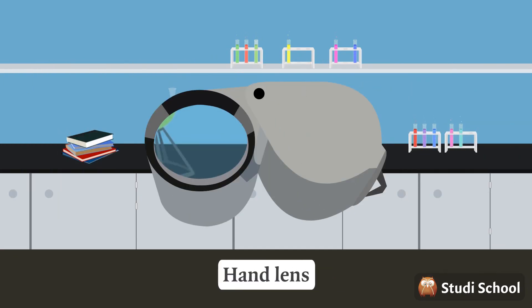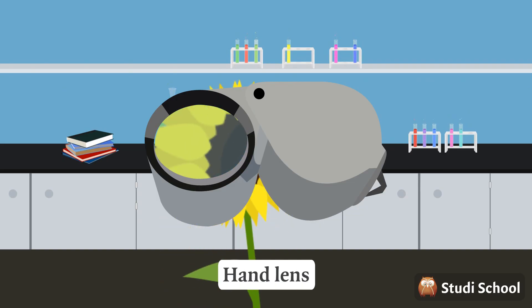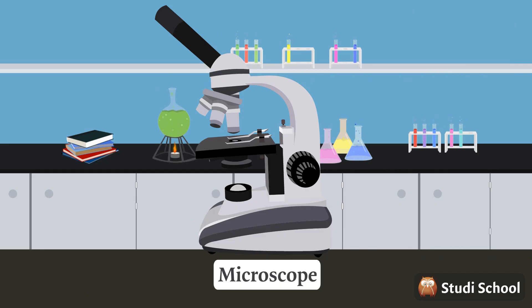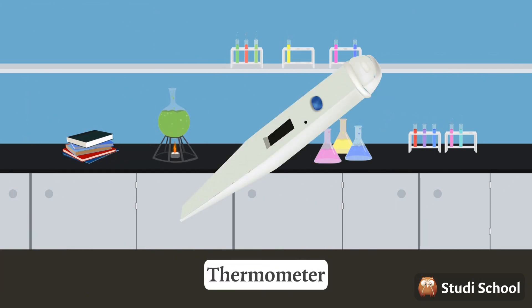This is a hand lens and can be used to magnify small objects and organisms. This is a microscope. It is used to look at specimens more closely. This is a thermometer and is used to measure temperature.